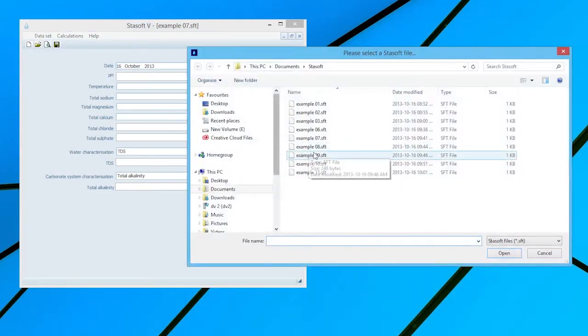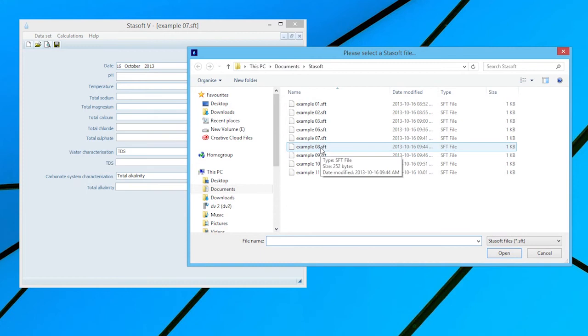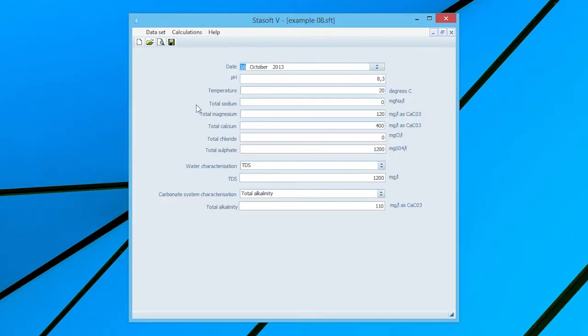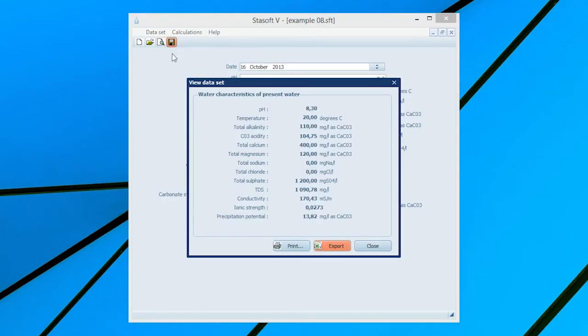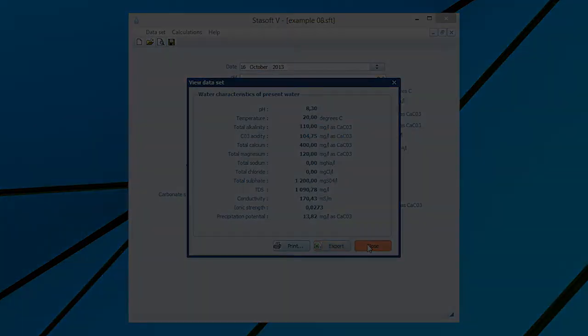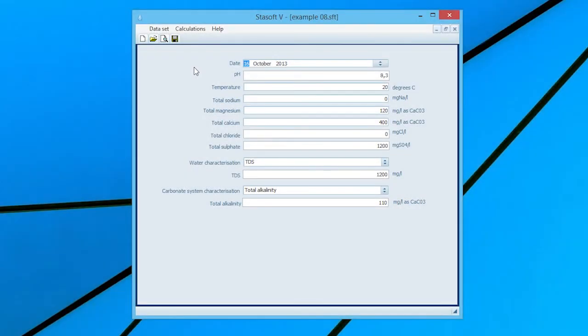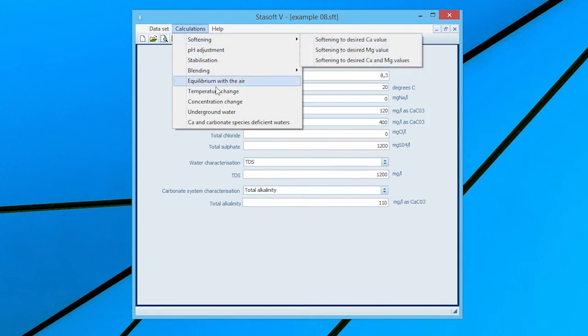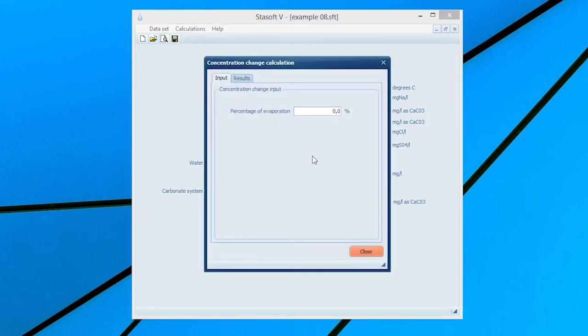Determining the final state of water after a change in concentration due to evaporation. Select Dataset 8 for Example 8 in the manual. After entering the data into the Dataset input window, selection of the View option will bring up the window displaying the characteristics of the present water onto the screen. Close the window and select the Concentration Change option from the Calculations menu, bringing up the Concentration Change input window.